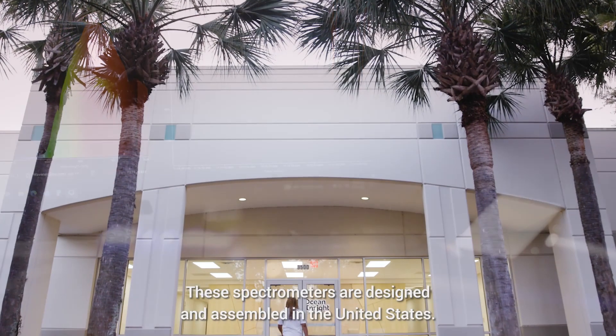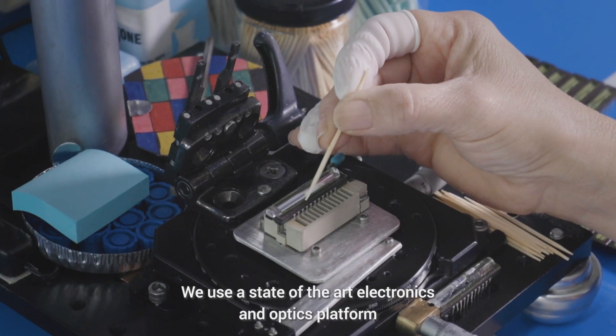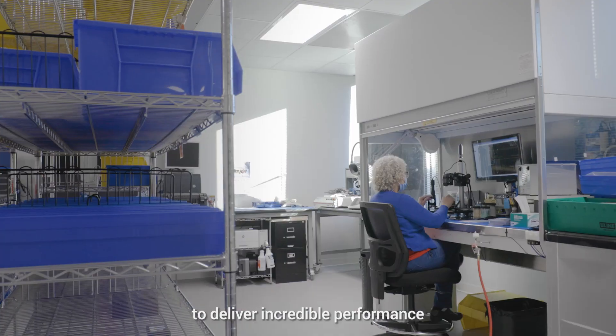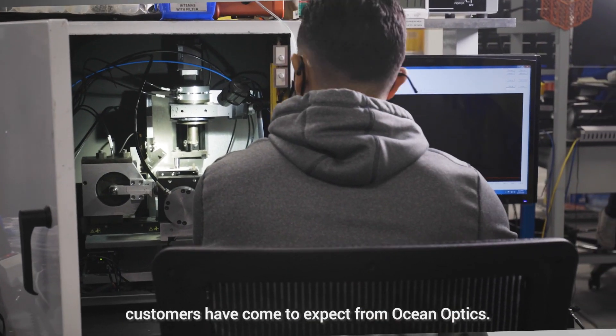These spectrometers are designed and assembled in the United States. We use a state-of-the-art electronics and optics platform to deliver the incredible performance customers have come to expect from OceanOptics.